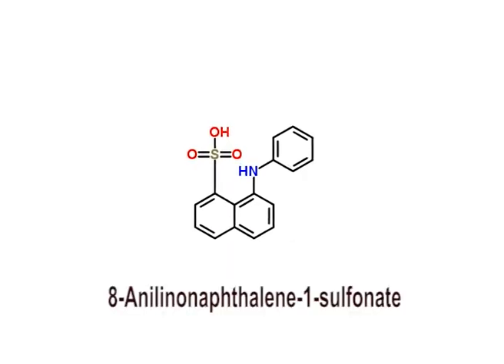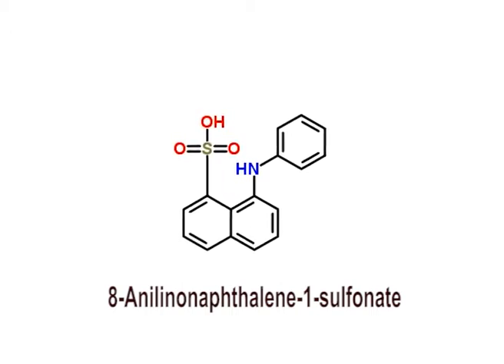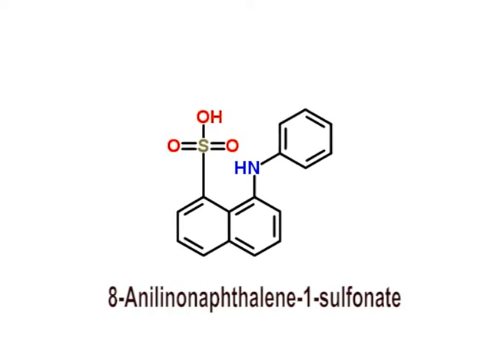Then we have 8-anilino-naphthalene 1-sulfonate. Its structure has been depicted on your screen and it has proved to be a valuable and sensitive reagent for detection of fingerprints on greasy and porous surfaces. The developed fingerprints, when impinged with long wavelength ultraviolet light, show bright yellow fluorescence against a dark background. Rapid development, no heat requirement, and simplicity are some of the other advantages of this technique.